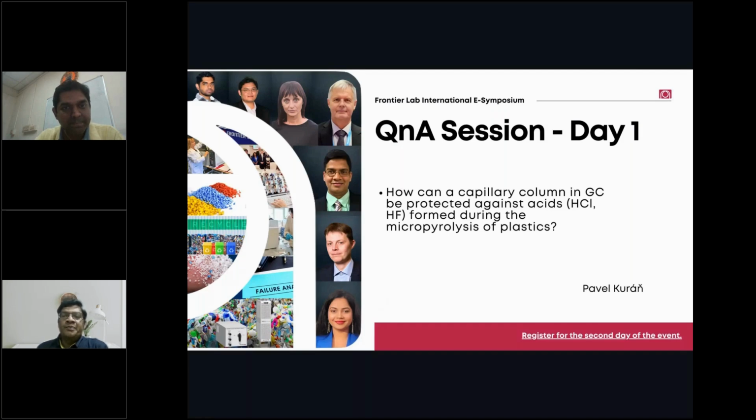No, no, no, because finally, we are normalizing the flux. The main reason is we are able to do this at microgram scale, whereas the weather meter requires a few grams of sample. So that's why the duration becomes longer, because you do not get so much light onto the sample, so the duration has to be extended to get the complete flux. Otherwise, they have to invest big money on a UV system with high watts power. So just to make it economical, they have a simple setup, but they have to run it for longer. Here the benefit we are seeing is that we use a micro amount of sample, and we are able to spot the UV light directly onto this piece of particle. That's why it is more effective and faster. Got it.